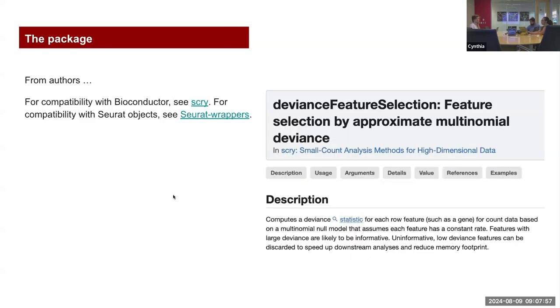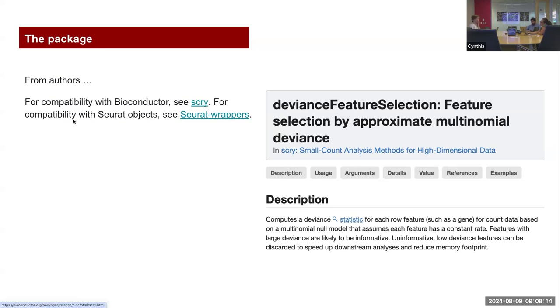I was looking for the main functions to implement the method. You can find that the compatibility for Bioconductor is found in Scry. There is also compatibility with several objects that you can look at in several properties.